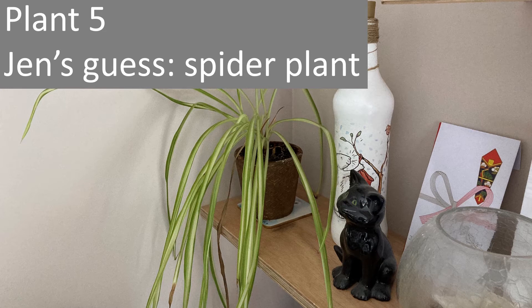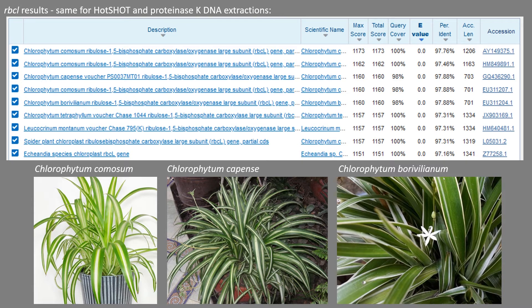Plant five was the first of the house plants. The top hits gave the genus Chlorophytum across all three results. I'm happy with that — I'm convinced that's correct.